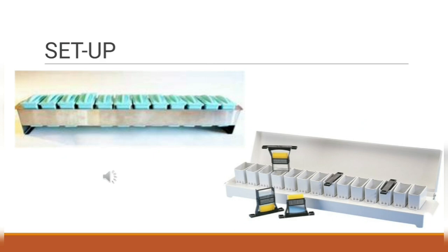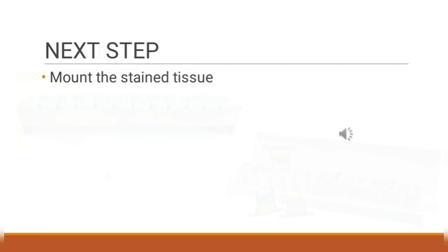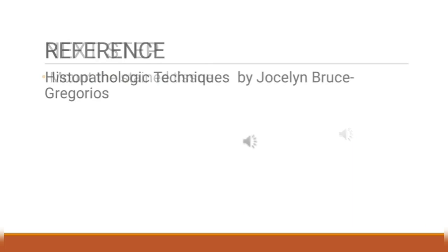This is how the manual H&E staining setup looks like. After staining the tissue via H&E staining, you can now mount the stained tissue. And here's for our reference.